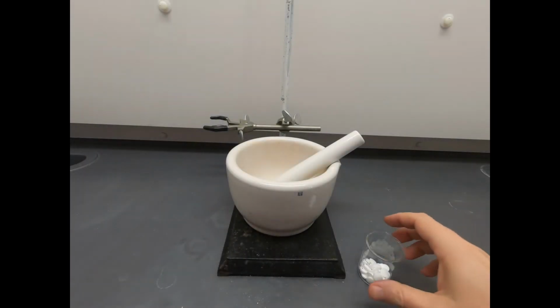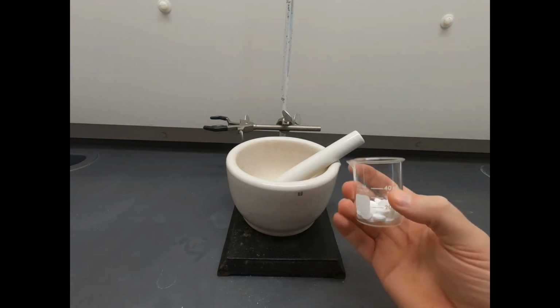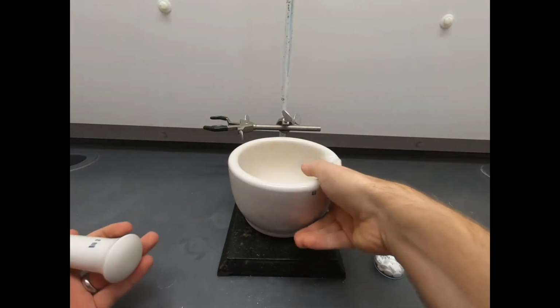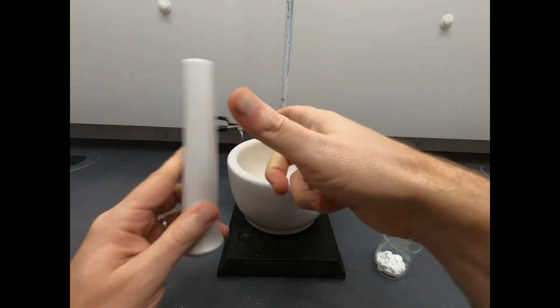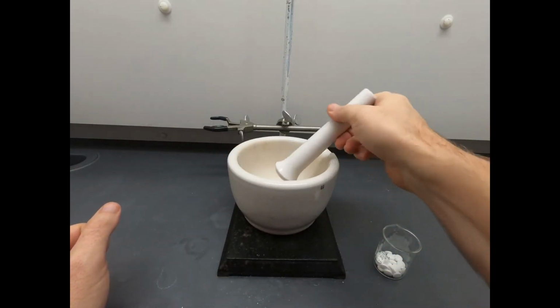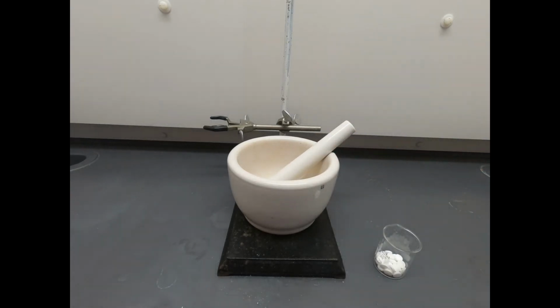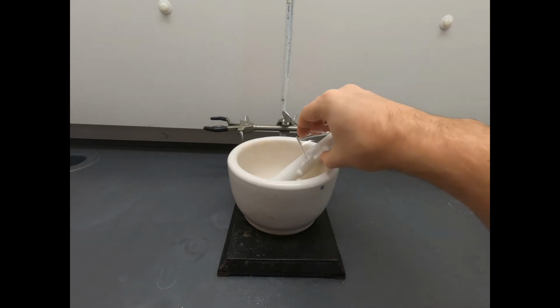Okay, let's get started. This is our beaker with 30 aspirin tablets, and we kind of have the star of the show. This is a mortar and pestle. The mortar is this ceramic bowl, and the pestle is what we're going to use to grind up these tablets. Mortar and pestles, because I'm a chemist, I associate these with chemistry labs, but the fact is you encounter them in cooking, you certainly encounter them in drug formulation.